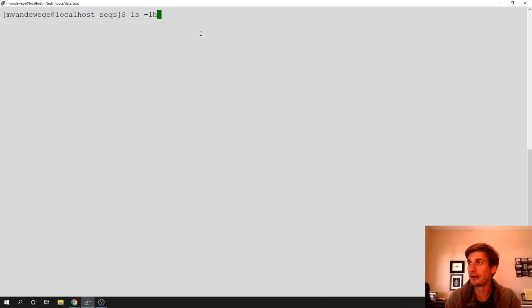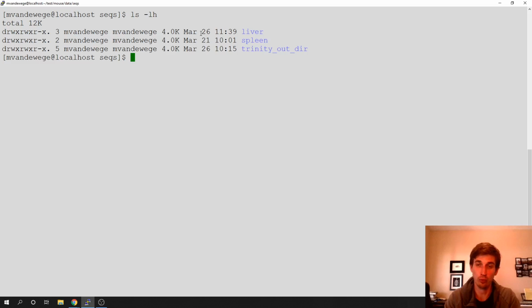Take a look, see if you can get this done and working. I think running Trinity is a little bit easier than running Trimmomatic. It's just an easier help menu. Yeah, I think that's it.